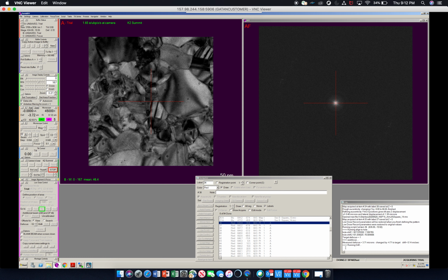Okay, so that is how you start data collection, and you should monitor this for a few minutes after you have actually seen images being collected. Verify that your holes are good quality and that the data output is great. And then you can move on to automated pre-processing in Scipion.